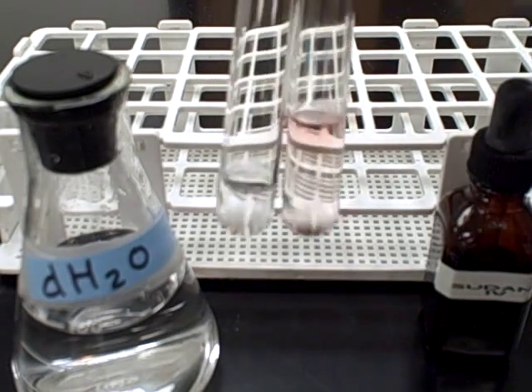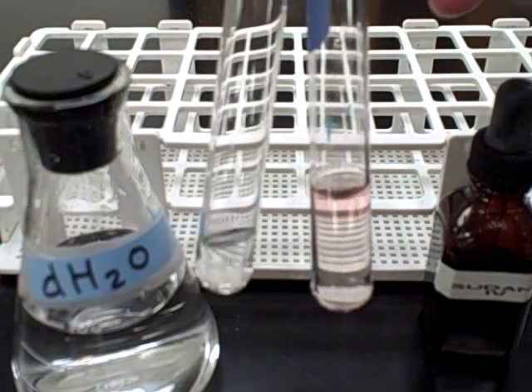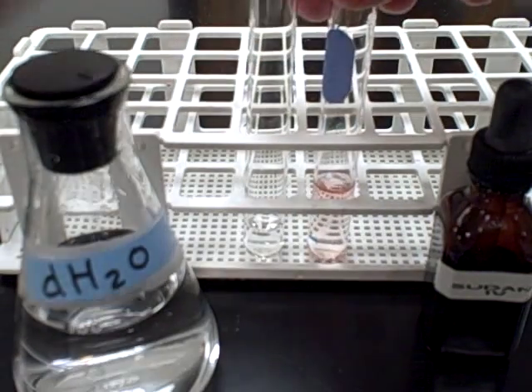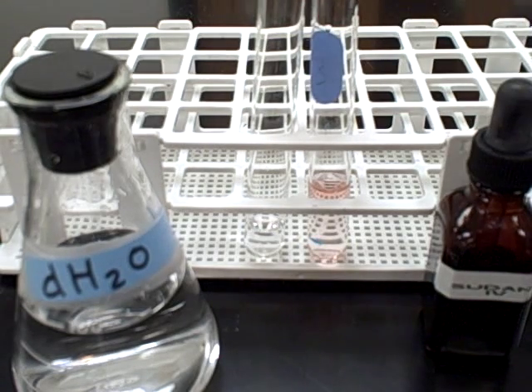I have two distilled water samples — one with Sudan 4 added, showing a slight red tint, and one without. The one without is in a lower volume and is perfectly clear, so we can see what a distilled water control looks like with and without Sudan 4 added.